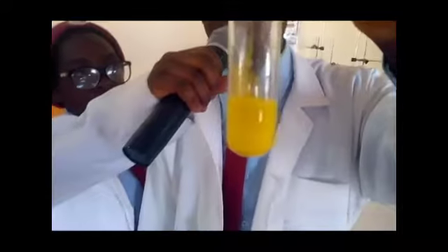Another one can be production or appearance of color. Now this is another reagent. Now you notice the color change or the production of this yellow color. Another one can be disappearance of color.